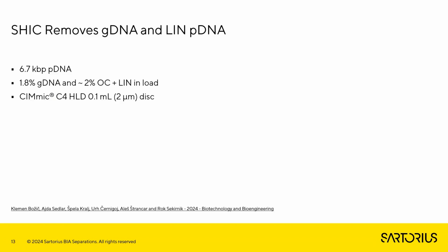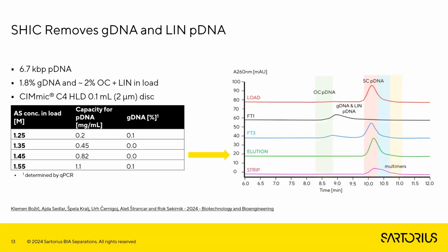But especially when scaling up the plasmid downstream process, some steps become challenging. For example, in batch alkaline lysis, poor control over lysis conditions, for example contact time with sodium hydroxide, mixing, and so on, results in increased amounts of host cell impurities, including genomic DNA. And HIC is actually a perfect tool to get rid of it.